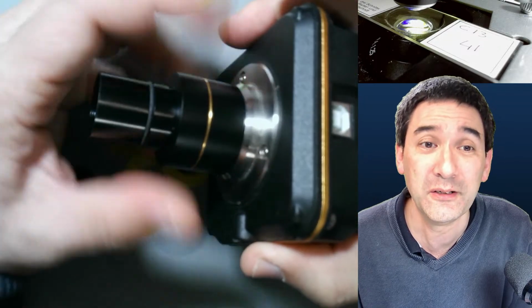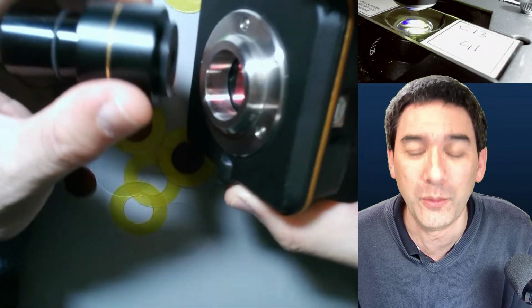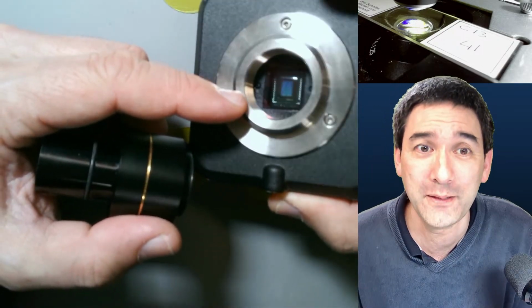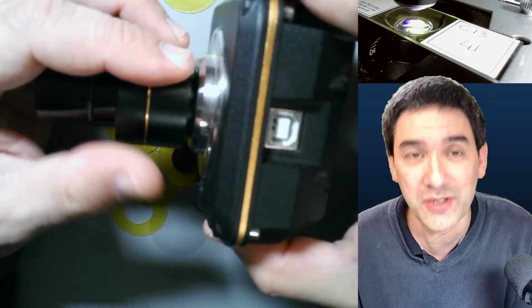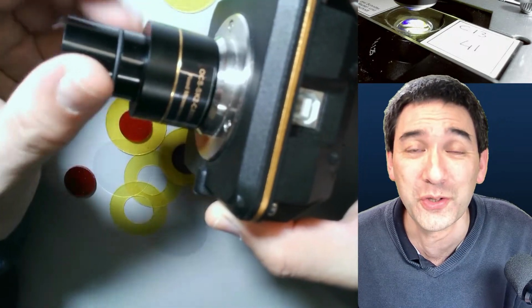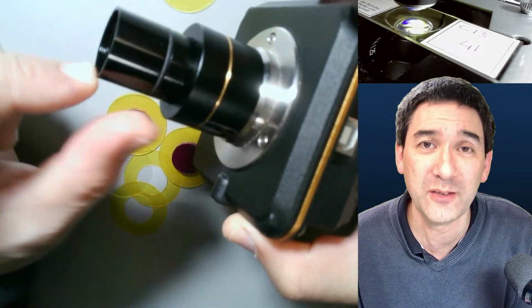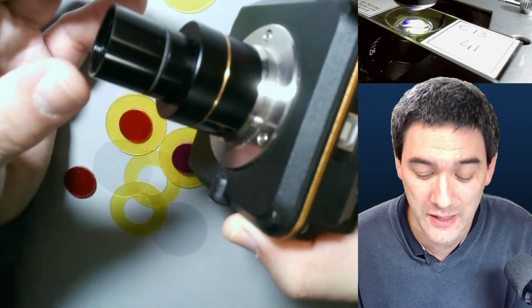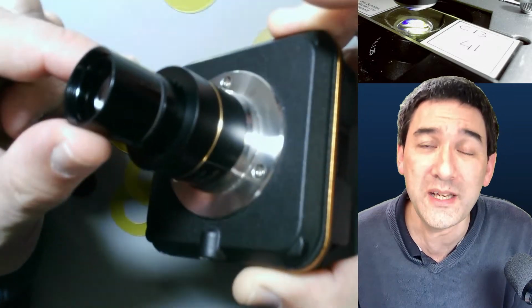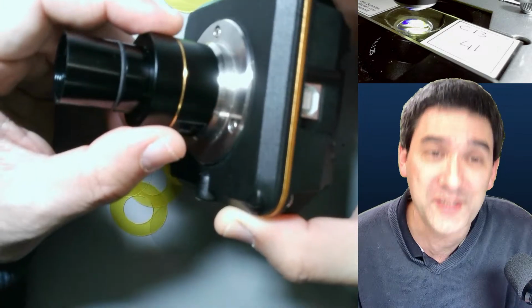There's some optics in here, and I'm going to show you something. When you open it, do you see this tiny thing in here? That is the sensor, right? Generally small sensors do not provide a very good image quality because the signal to noise ratio is not very good. And you also have optics in here, and the optics focus the light in such a way that you're able to fit the image on the sensor, and the optics also degrades the image quality. So that is already a problem, and the small sensor is a problem.